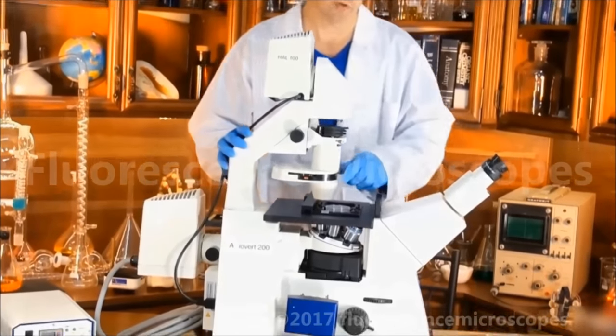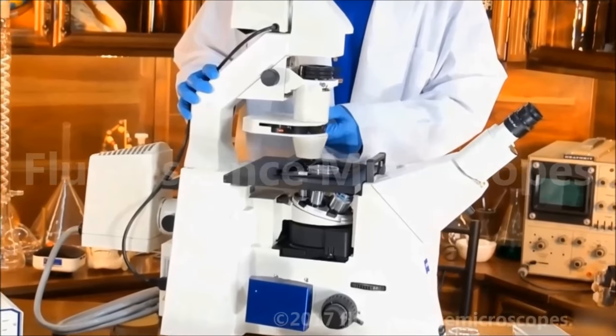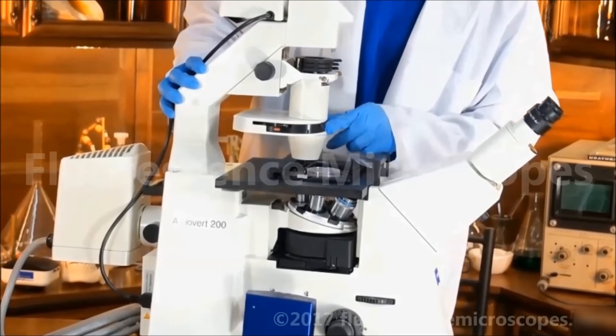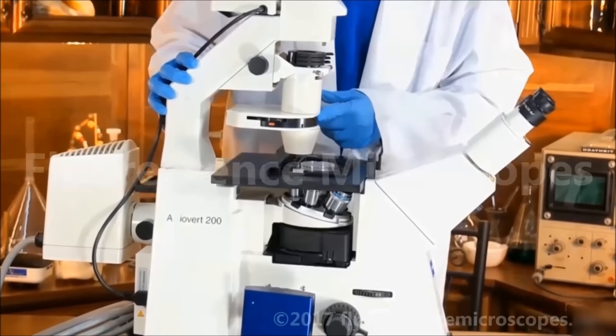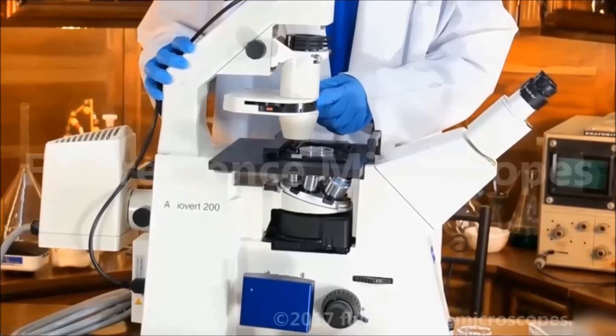It has a full rotary condenser with phase. You can also add DIC to this. This particular microscope has not been configured with DIC, but it can be added.